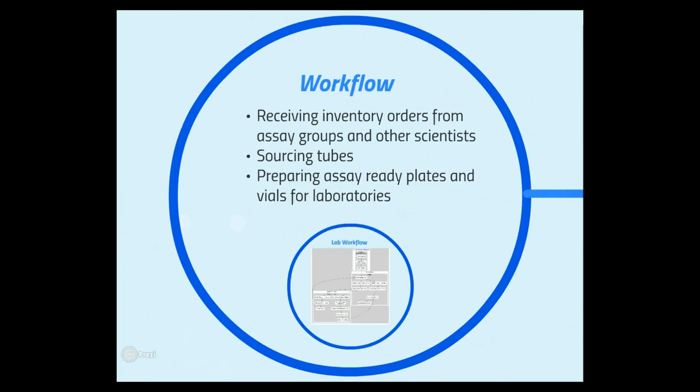The third area of challenge is around workflow. So obviously there's a lot of workflow involved in an organization, both receiving inventory orders from assay groups that need them for their assays, or other scientists such as formulation scientists needing powder to be ordered so they can formulate the compounds.